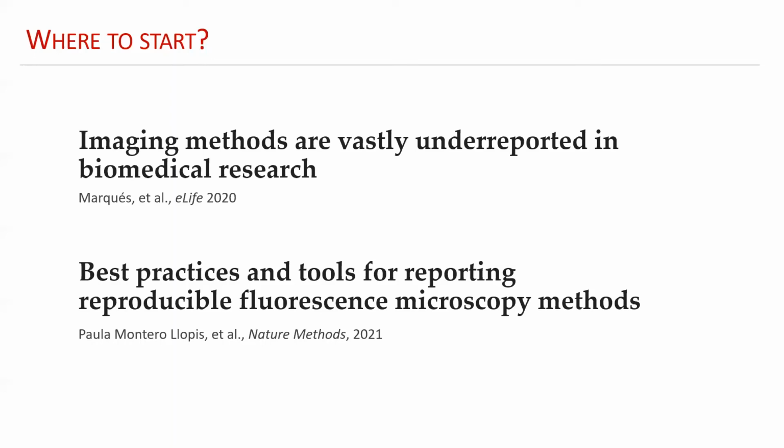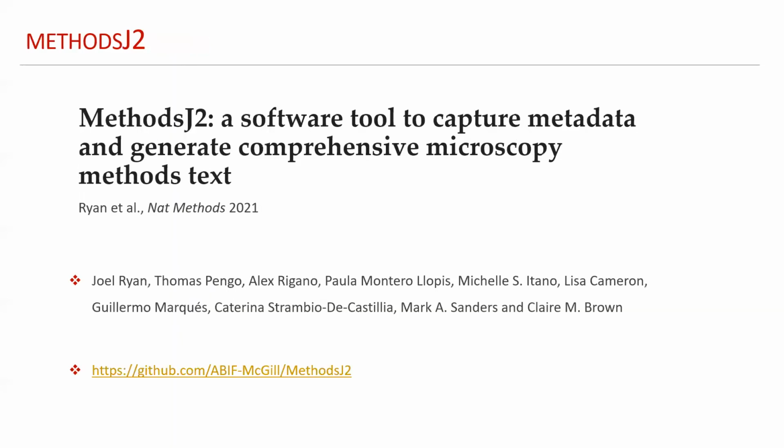Building on these findings, recommendations, and tools, and using Micro-Meta App files, we'll discuss in this series MethodsJ2 and how it can help with writing method sections.